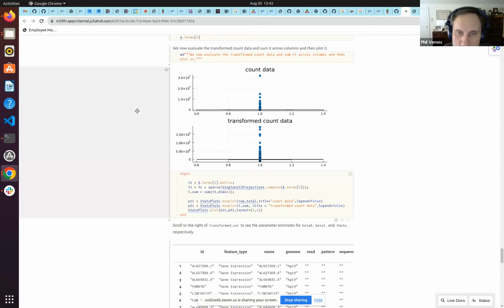With respect to visualizing the transformation of the counts after doing this, the negative binomial approximation with a Poisson, I just do that right here. It's very straightforward. But what's interesting is for me to actually count it, look what I did.